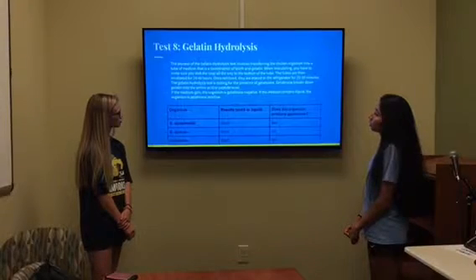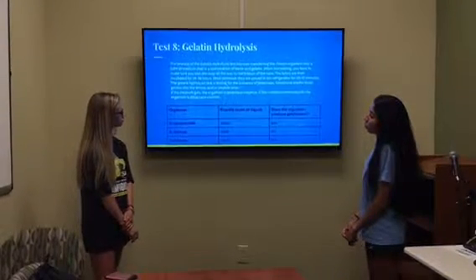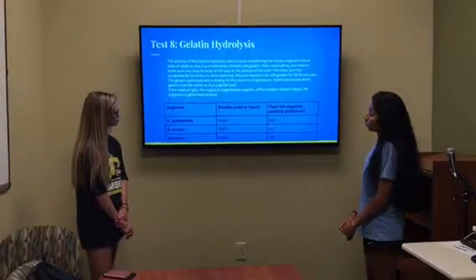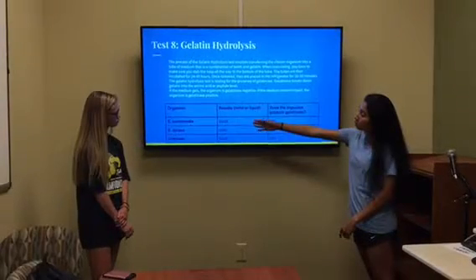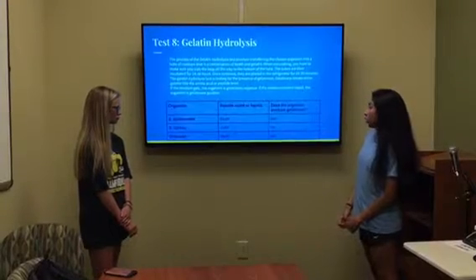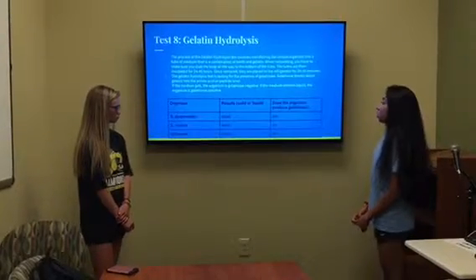Gelatinase breaks down gelatin into the amino acid or peptide level. If the medium gels, the organism is gelatinase negative. If the medium remains liquid, the organism is gelatinase positive. So we tested these 3 organisms and our unknown, and its result was liquid, which means that it does produce gelatinase.